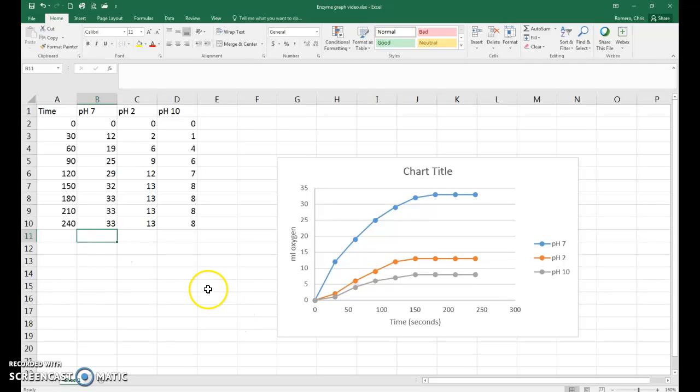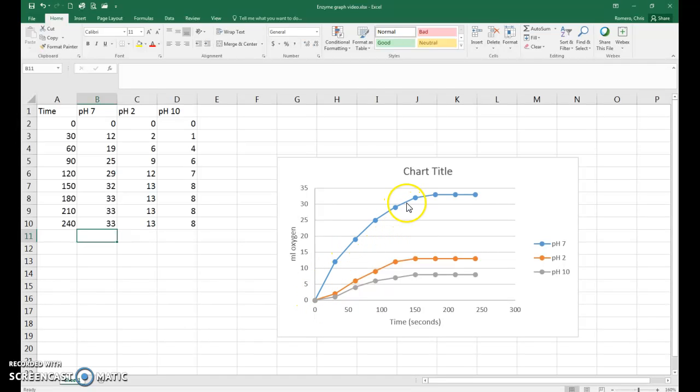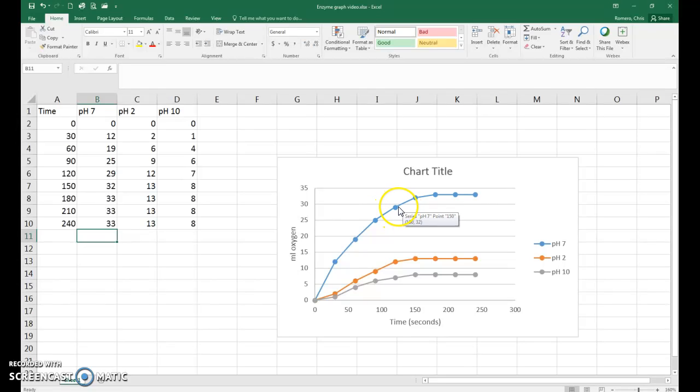Before we do the calculation, let's go and look at our line here. So we'll use pH 7 as the example. If you notice, the line begins to level off around 120 seconds.